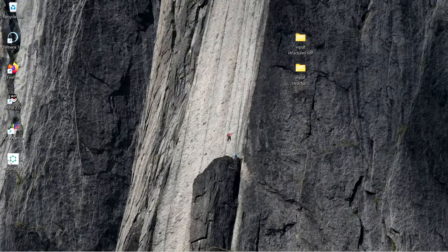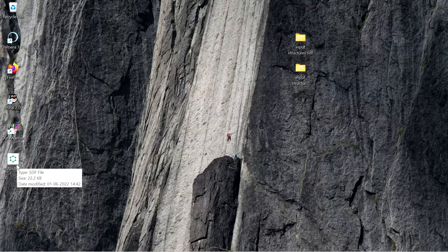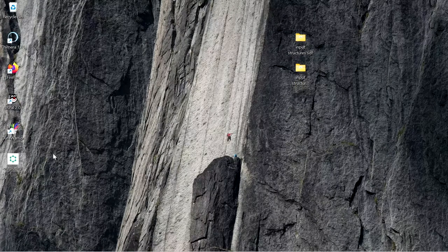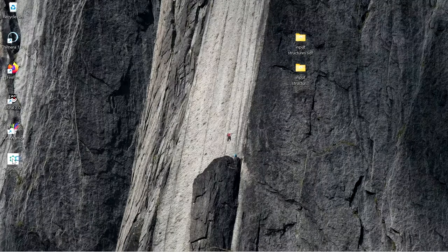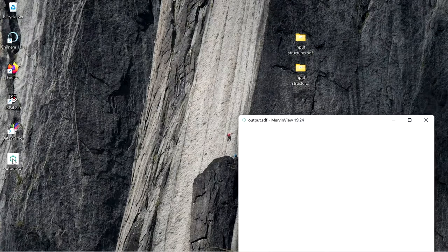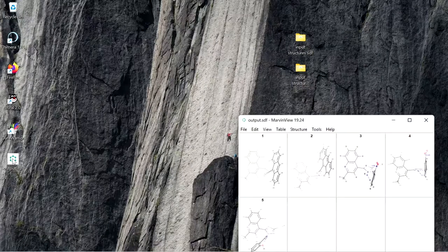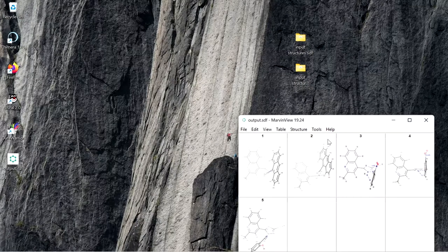In the desktop you have this file output.sdf. In this file you have five structures. These are the five structures in this sdf file.